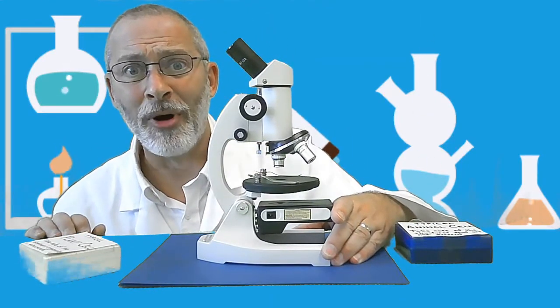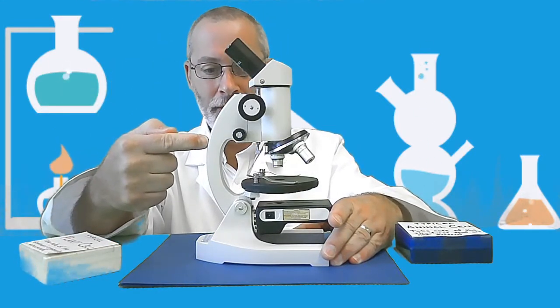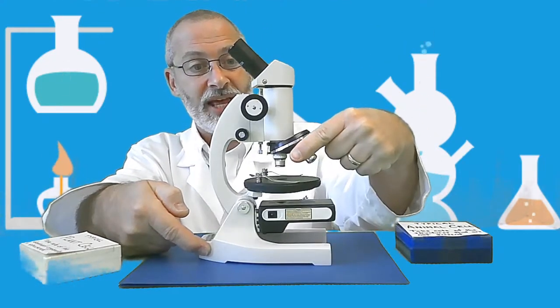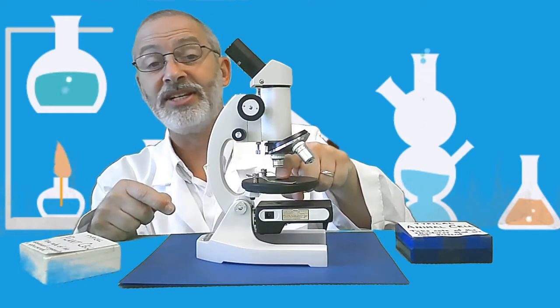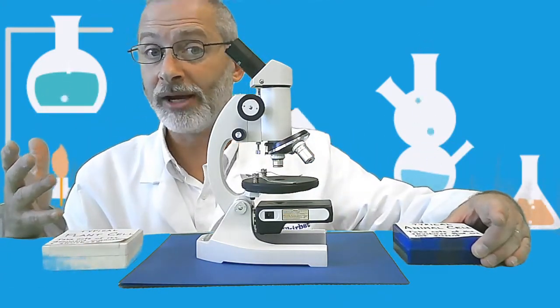I think we got them all. Eyepiece lens, arm, base, body tube, nose piece, objective lenses, coarse adjustment, fine adjustment knobs, the stage, the light, and the diaphragm. So that's a good review on the parts of the microscope.